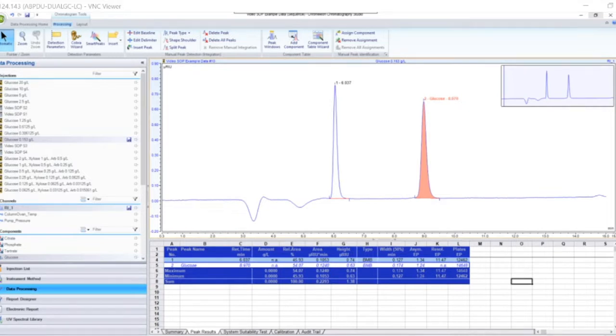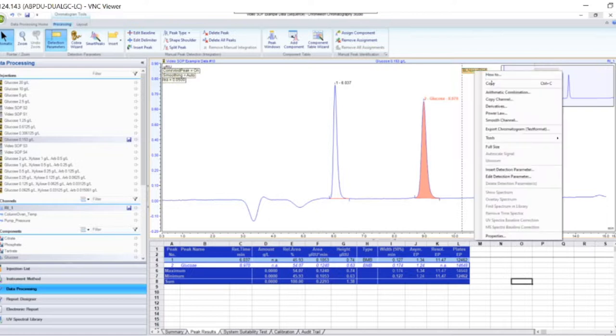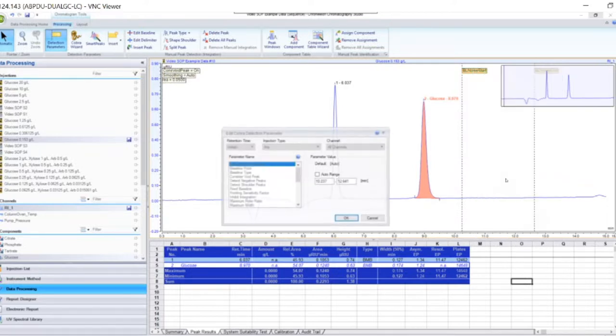You can modify detection parameters by selecting the Detection Parameters tab. To move a detection parameter, simply grab the parameter tag or line and drag it to the desired location. To edit a parameter, double-click on the tab and edit the value.